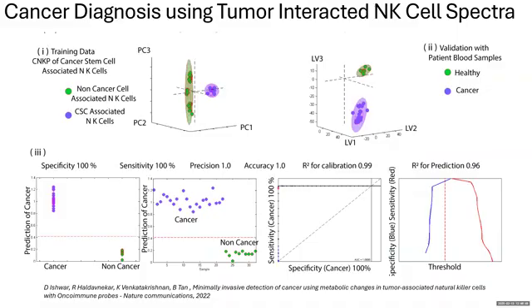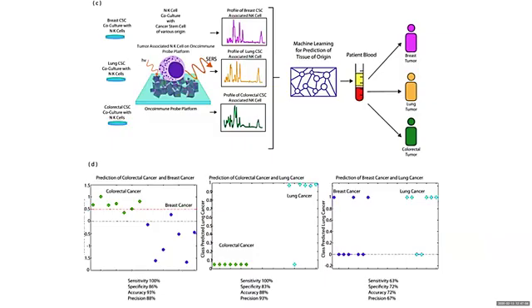So we did an experiment to confirm this hypothesis, and the classification was very good. Keeping in mind that we have a small data set here, to conclusively say that this is the best way of diagnosis, we need to do a large scale study or even a clinical trial. Tissue of origin detection also showed good accuracy as compared to the DNA structure, where we were not able to classify between breast cancer versus colorectal cancer. Here we can get good accuracy and good specificity for the classification.